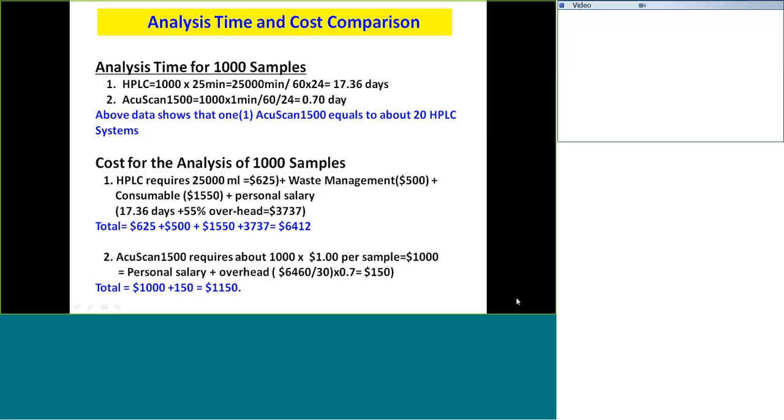Your proposal is good because the money is money. It's good. But in the pharmaceutical industry, the problem is regulation. Replacing the HPLC is not easy. Foods, no problem, because there is no regulation. The regulation is easy, no problem. The cost is good.